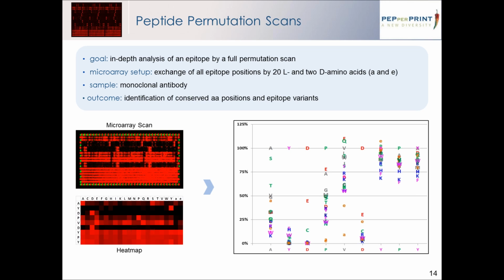In contrast to that, the last 3 amino acids can be replaced by any other amino acids, suggesting that they play a minor role in epitope binding. You can see this here. And on the right, you have another description of the same results.